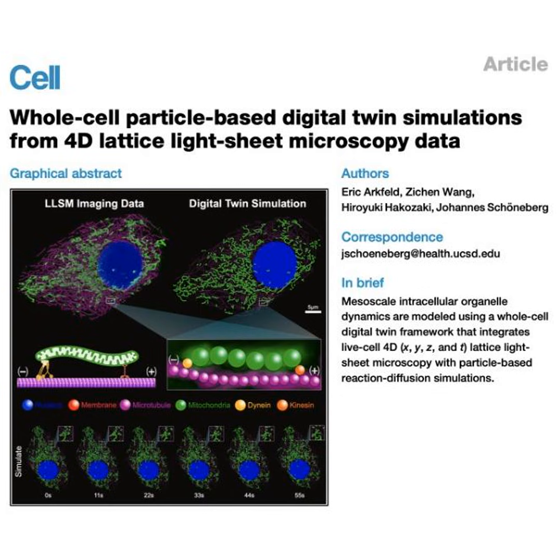Okay, so gathering our thoughts here before we move on, just to recap for you listening. The big historical problem was that whole cell models either gave us dead snapshots or just pure math without a physical shape. Right. Traditional microscopes couldn't solve this because they literally burn the cell alive. But this new gentle light sheet technology lets us safely film a high-def 3D movie of the cell over time.